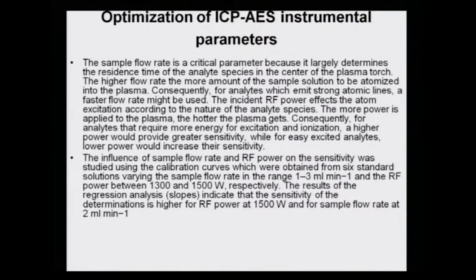The incident RF power affects the atom excitation according to the nature of the analyte species. The more power is applied to the plasma, the hotter the plasma gets. Consequently, for analytes that require more energy for excitation and ionization, a high power would provide greater sensitivity, while for easily excited analytes, low power would increase their sensitivity.